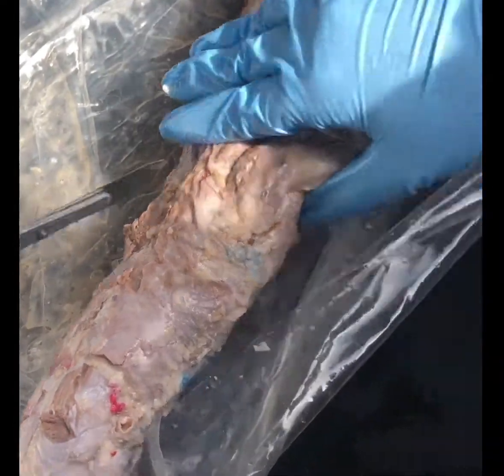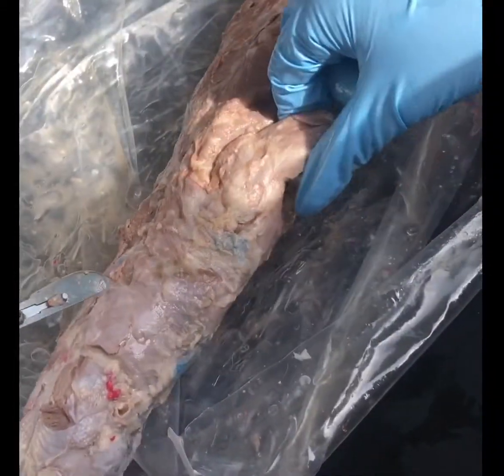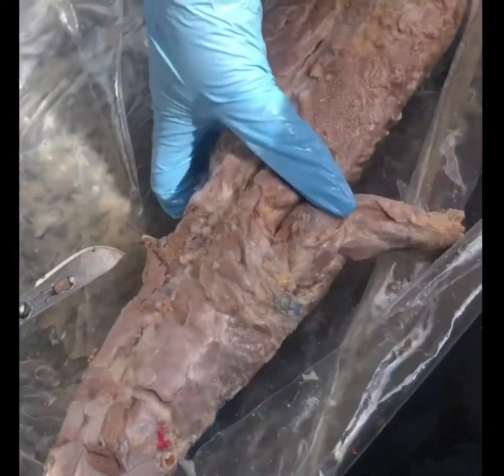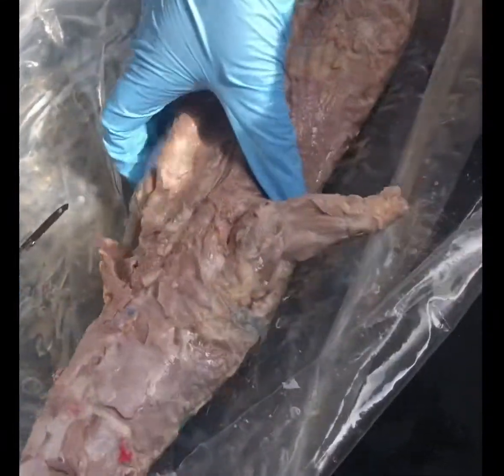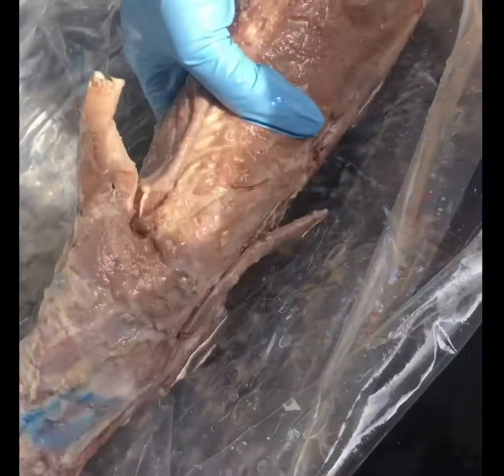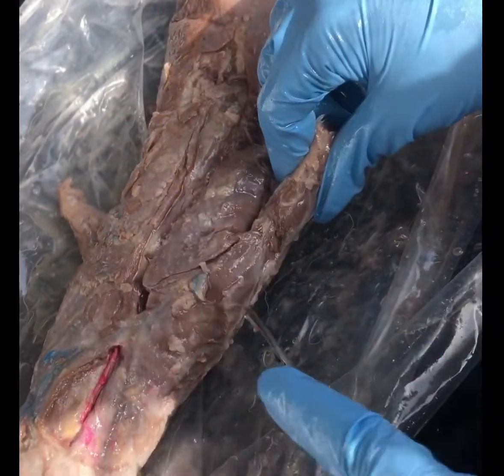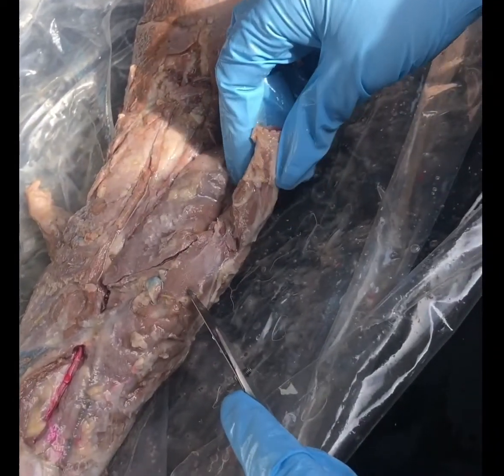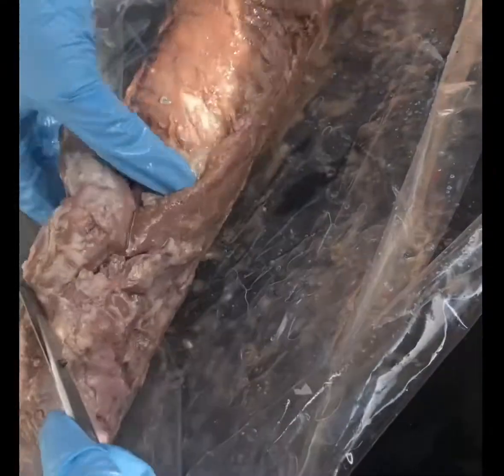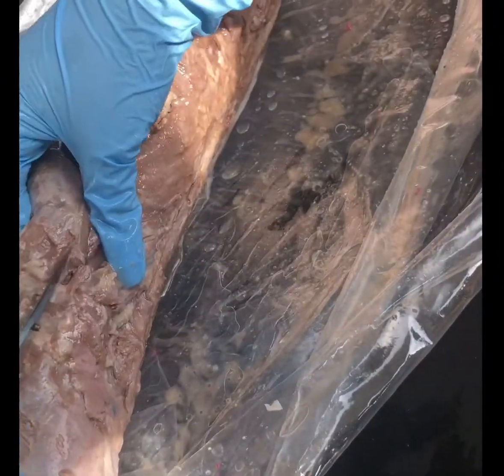We have the deltoid, which is the muscle of the shoulder, which you can see like right here. That's also on this side. It's right here. The biceps brachii is the muscle that flexes the arm, basically your biceps right here. And then the triceps brachii is right behind it, so it's this muscle right here.